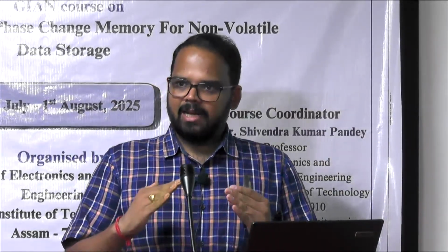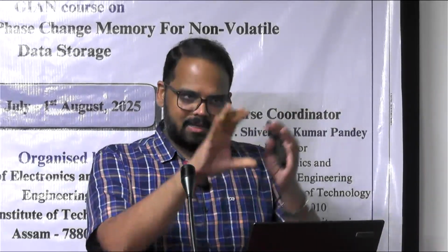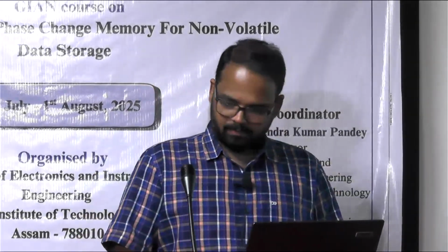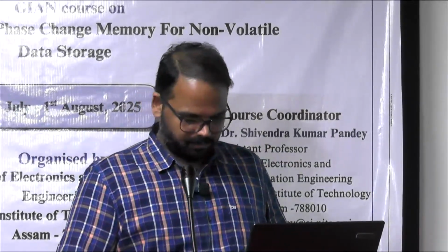You just go there and see the instrument, and possibly we'll try to show you the deposition also, deposition of any material, where you can see the plasma, and see the sputtering setup, what components are available, and how we can prepare a chalcogenide based thin film. Okay, thank you. Let's move towards the lab.